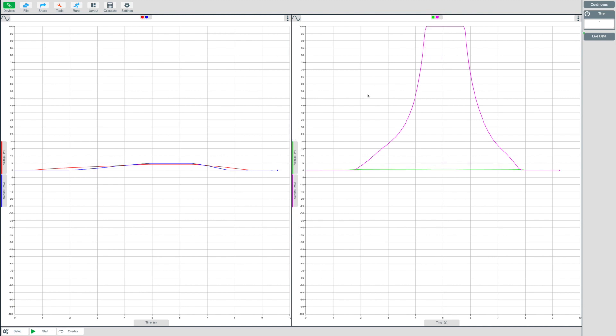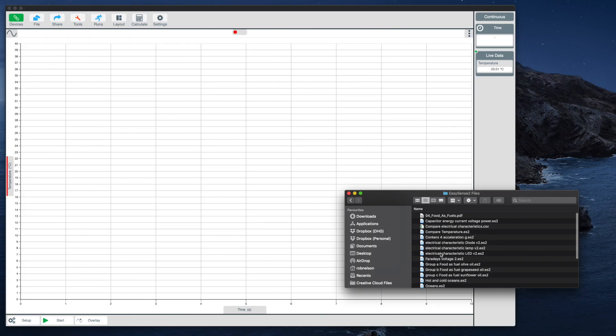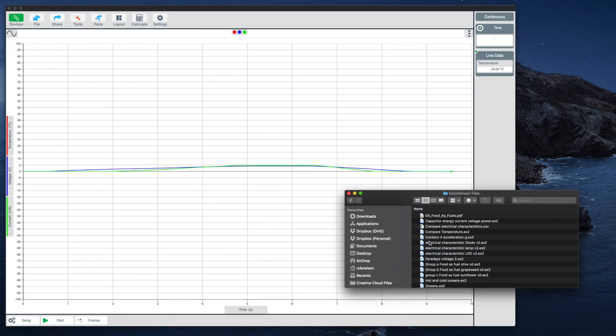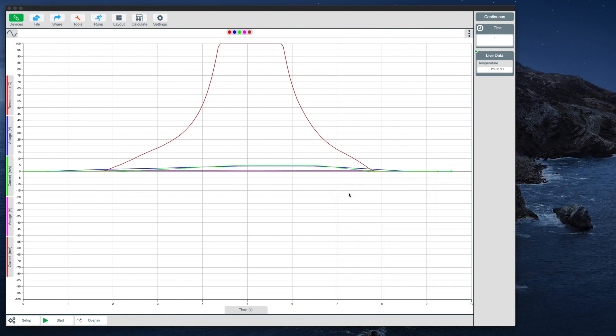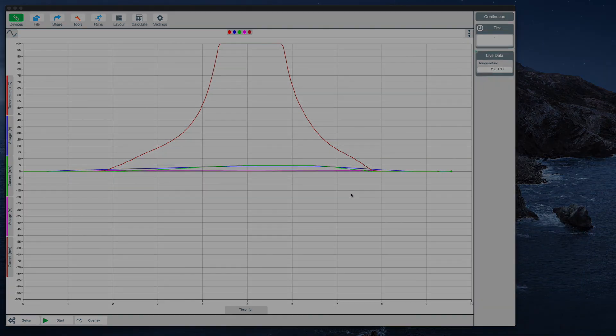The same principle applies for importing from device. The only difference is the source of data. Another way to import data from files on desktop computers is to drag and drop a file directly onto the EasySense 2 software.